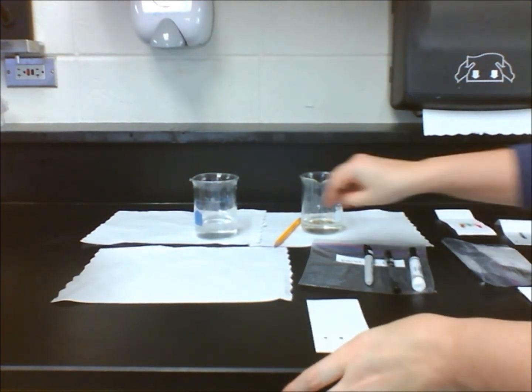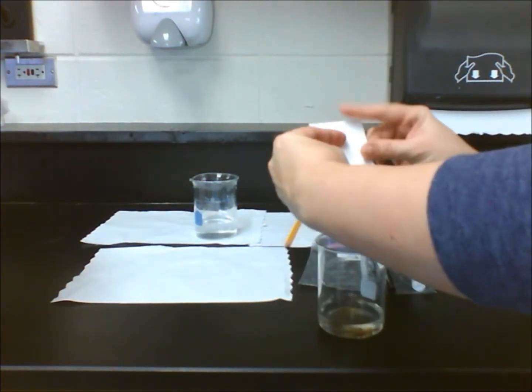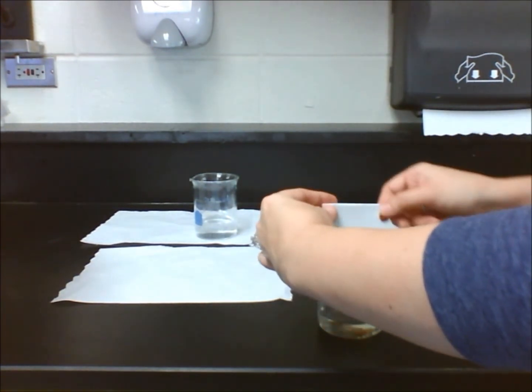After allowing the solutes to separate, we can see that pen B is insoluble. It didn't travel up the paper at all.